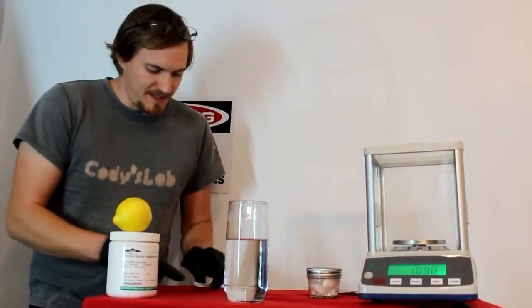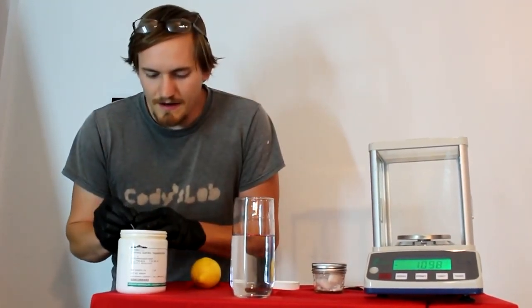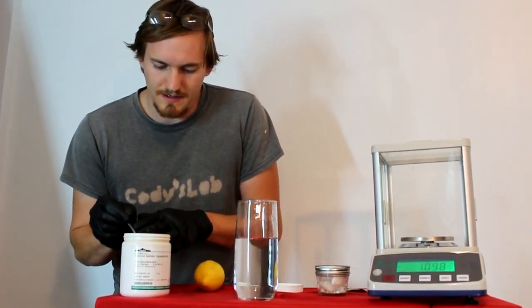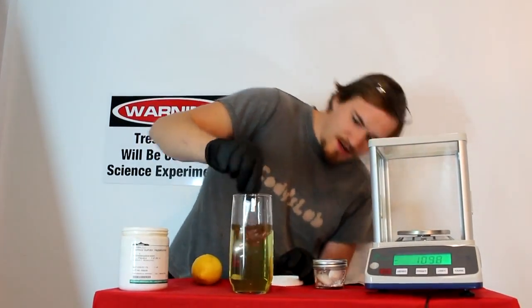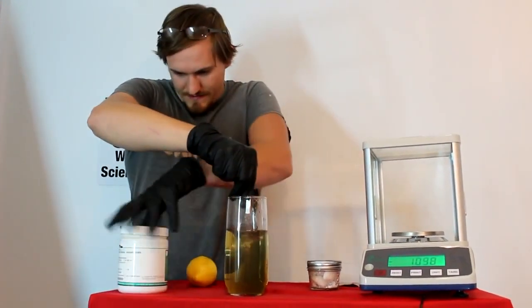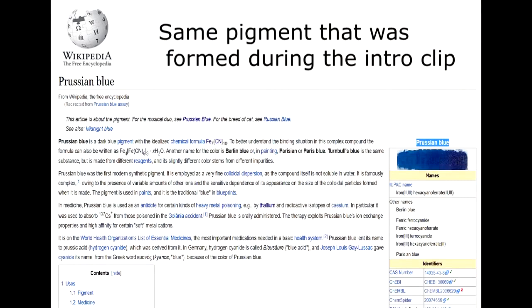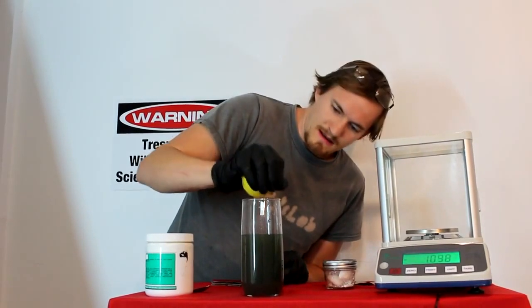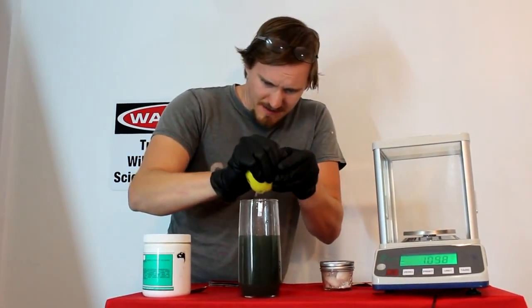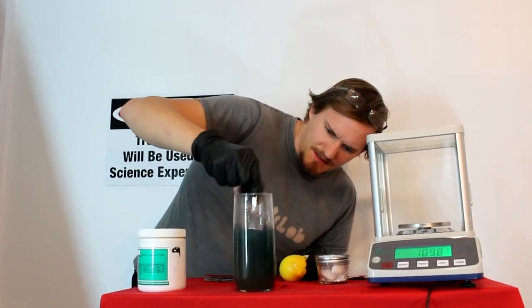And now to prove that this actually is cyanide, let's clean off my spoon here. I'm going to take a little bit of this ferrous sulfate — just a very small amount. Give this another stir. It should turn a nice greenish yellow. And it might even start turning a little bit blue as Prussian blue is being formed in the solution. To help the process along, I can add in a little bit of an acid — how about a lemon? Give this a squeeze, put some of the lemon juice in there. That acidifies the solution, making the test more sensitive. That should be enough to detect that small amount of cyanide.